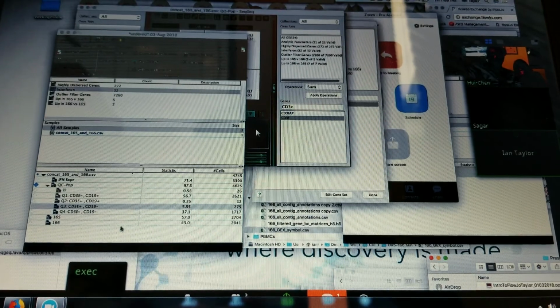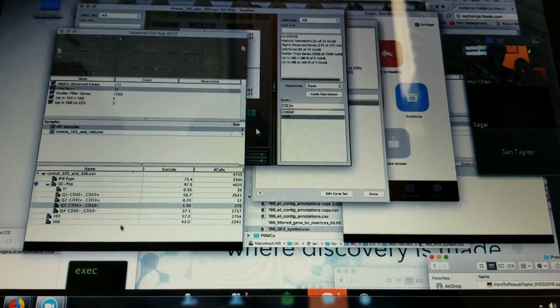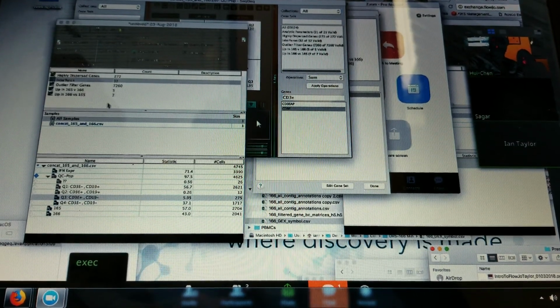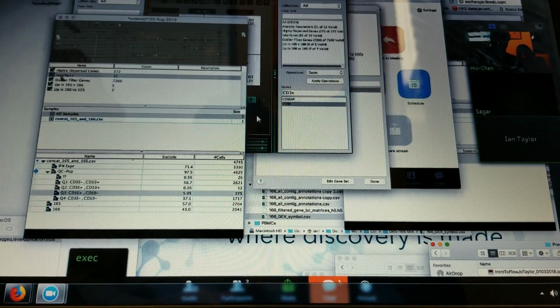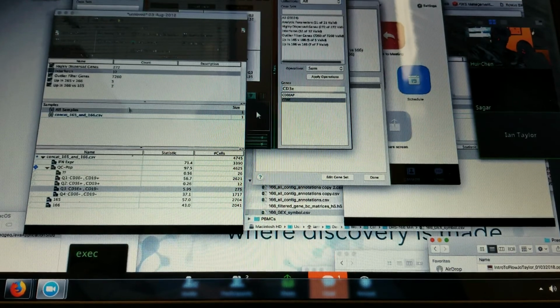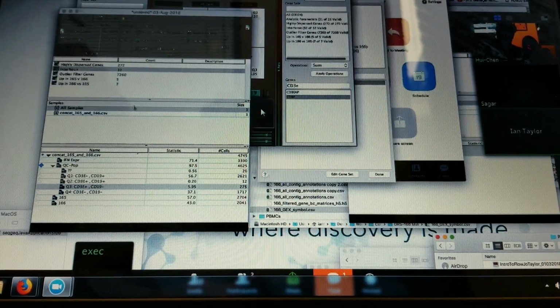Right. Well, how do they get up to the gene area? What do you call the top area? The gene? So these are gene sets. Gene set area. And so far, all of these, with the exception of the interferon gene set, were created by drawing geometric shapes or gates within the graph.